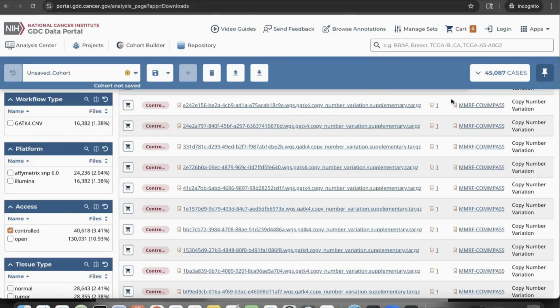Hey, thanks, Zenyu. And I totally missed this question. Apologies for that. I think you actually touched on this a little bit, but the question is, I've heard that ASCAT has to be run several times on the same input data to determine the right estimates for purity and ploidy. It is likely the first run result is unreliable. How does the GDC ASCAT workflow handle this issue? Yeah, that's also related to the multiple model purity issues. And some people use another tool to derive the purity and feed it into the input of ASCAT.